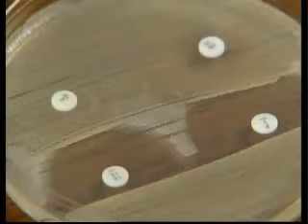Here, the resistant test strain in the upper section of the plate has been inoculated over the control strain, and inhibition of the control strain has been obscured. This makes interpretation of the test difficult.